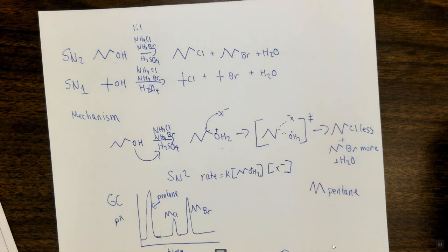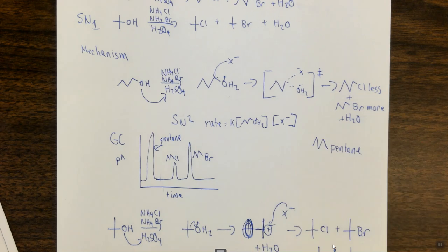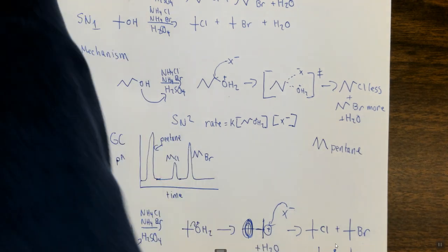For the T-butanol, you simply set it into a round bottom flask on a stir plate, gently stir it, and add 4 milliliters of the 2-methyl-2-propanol, which is T-butanol, to the flask, and you can just put a stopper on it and allow it to stir for several minutes.